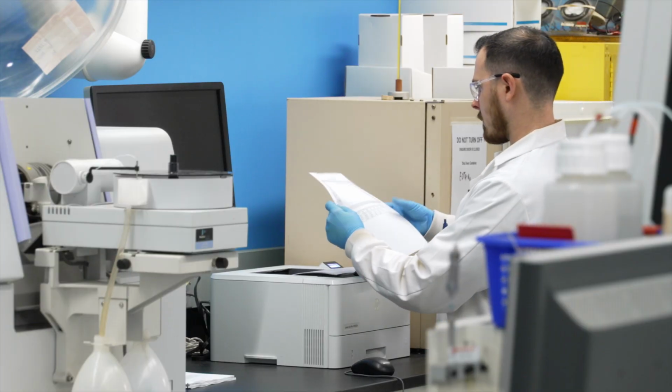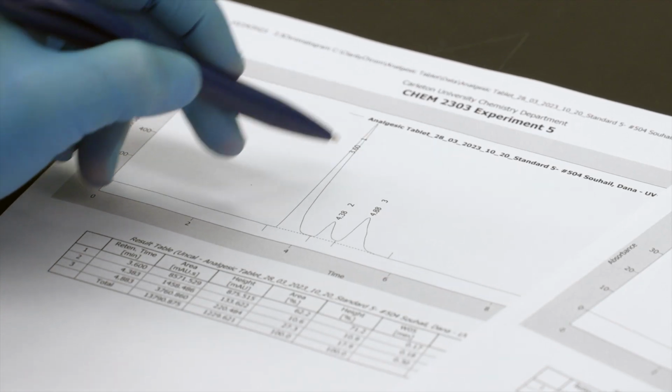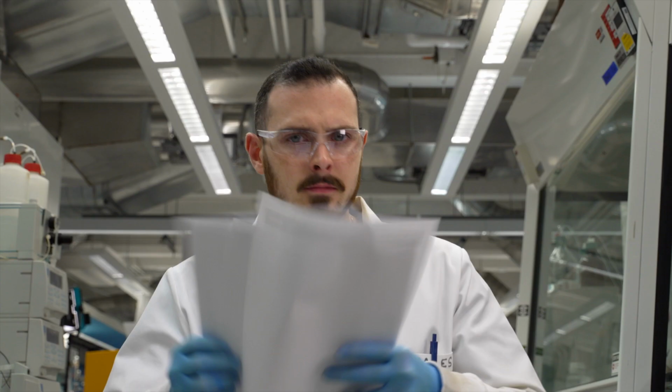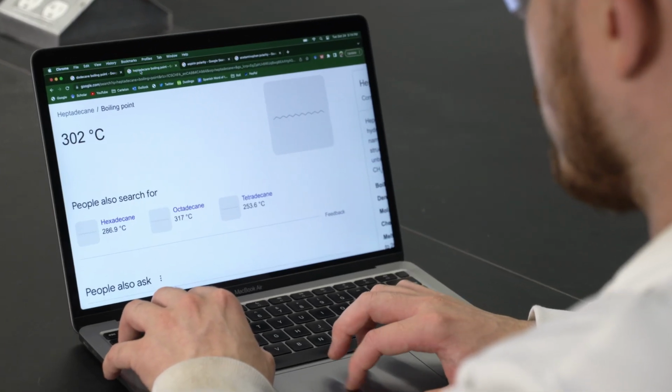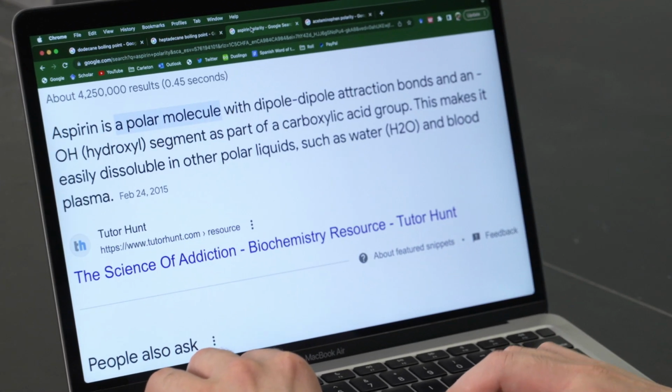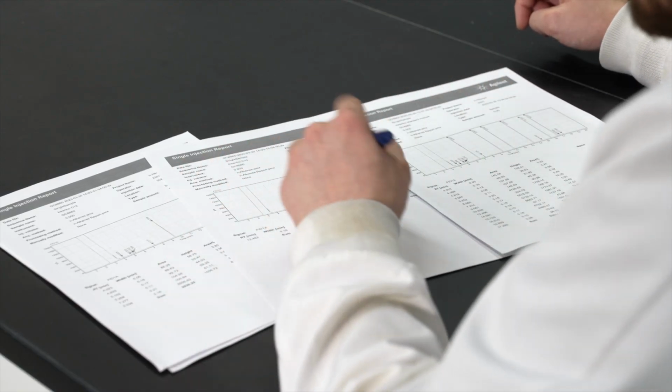As you receive your data from the printer, you'll realize that your sample mixtures will have multiple peaks correlating to expected analytes in your sample, but they unfortunately won't be assigned for you. That's where you come in. Using your knowledge of boiling points for GC, polarities for LC, and retention times for both, you'll be able to assign each analyte to the correct peak in no time.